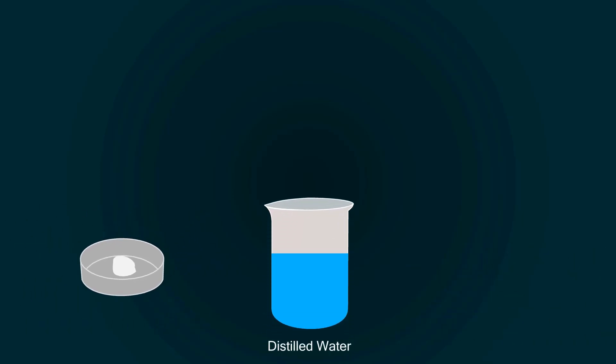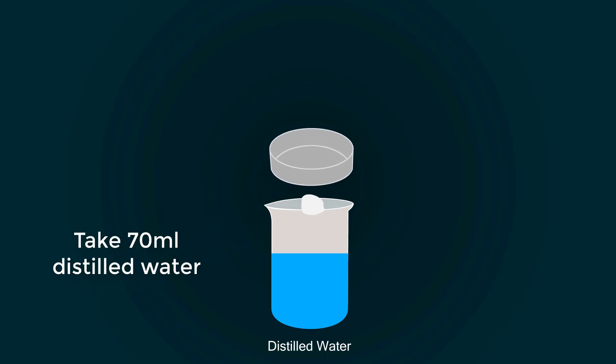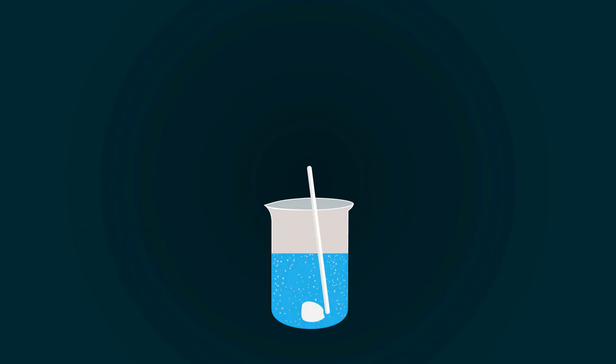Now add the potassium hydroxide into the distilled water. You can take distilled water up to 70 milliliters for mixing. You have to make a homogeneous mixture.